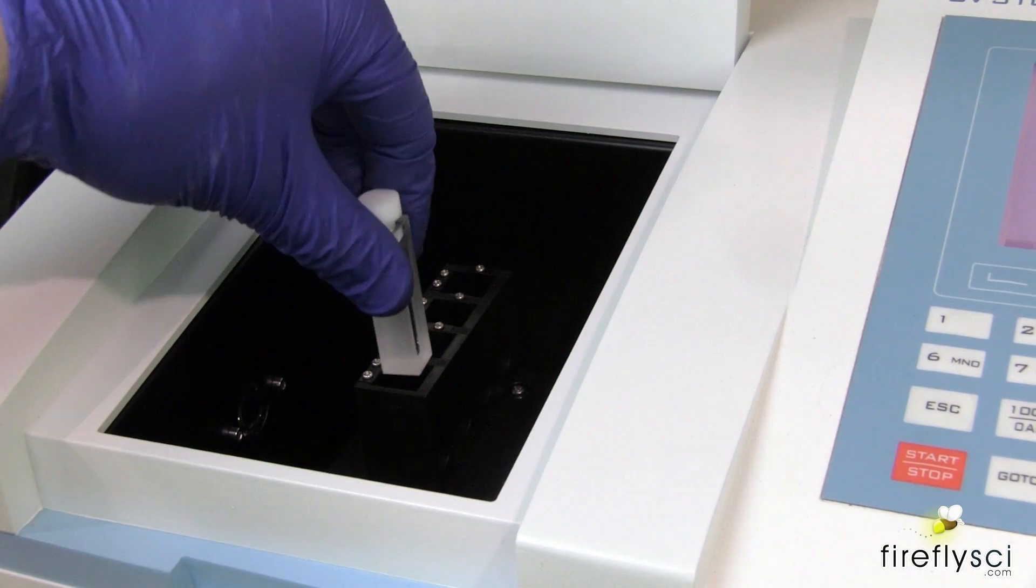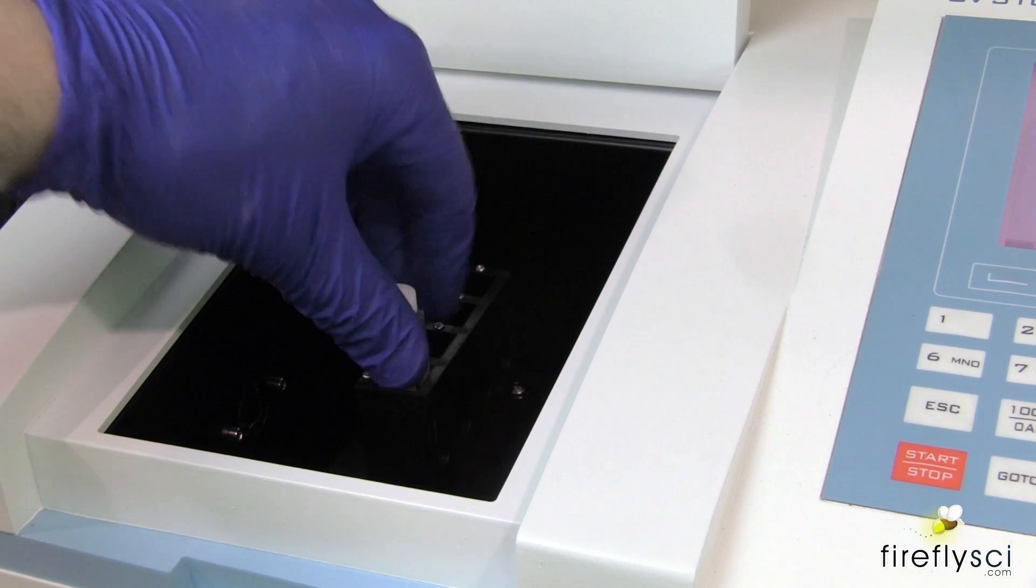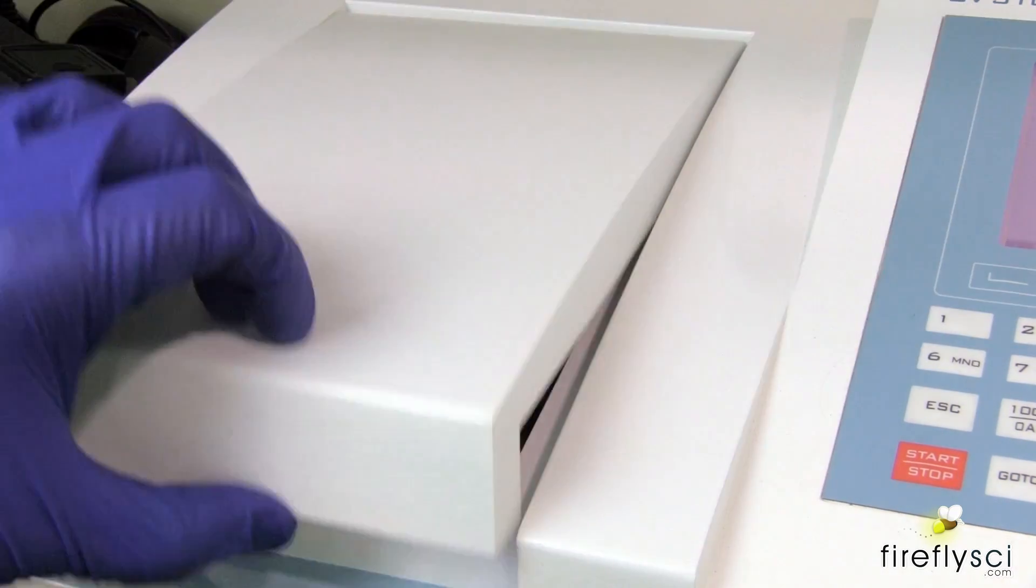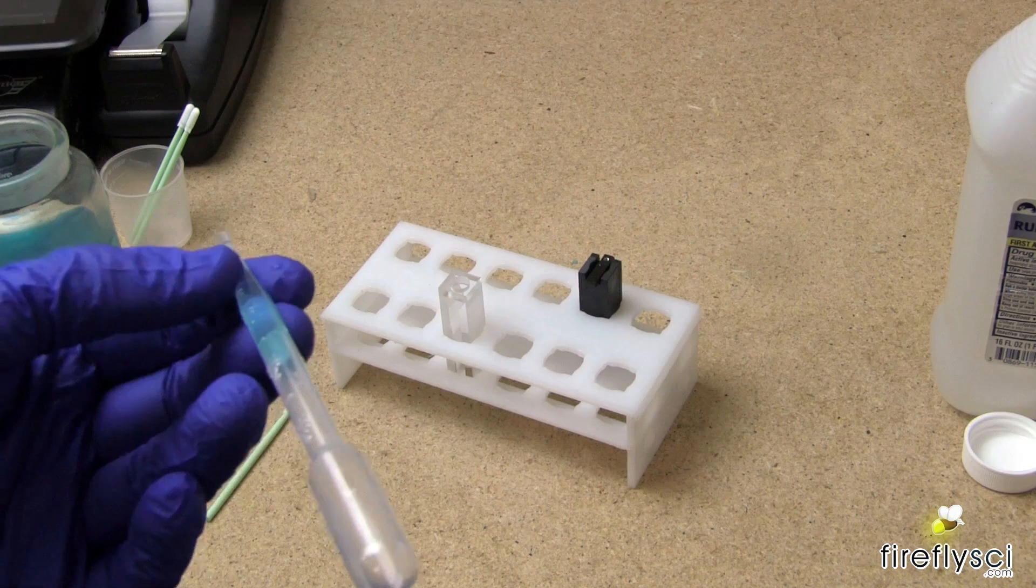So what we've just done is tell the machine to ignore the cuvette and the water and only give us the absorbance for our test sample. Since our test sample is mixed with water, we want to make sure we eliminate the water element.